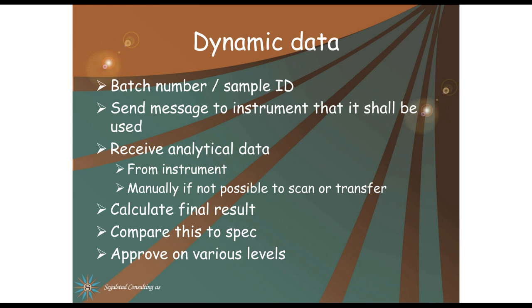Now a little on the dynamic data. As we have entered the static data for all our sample types, instruments, reagents, methods, specifications, etc., we can use LIMS for the daily use. We have also connected the dots so that LIMS knows that this sample type needs these analytical methods and have these defined specifications. As the analytical methods are also connected to our reagents and our instruments, we have a good overview of our data and where they come from.